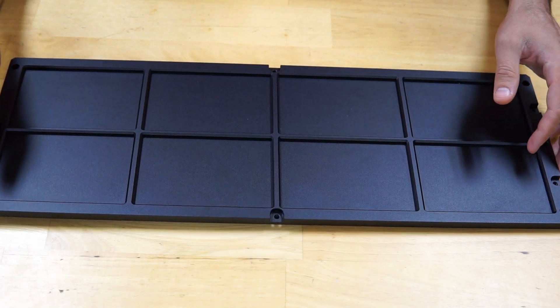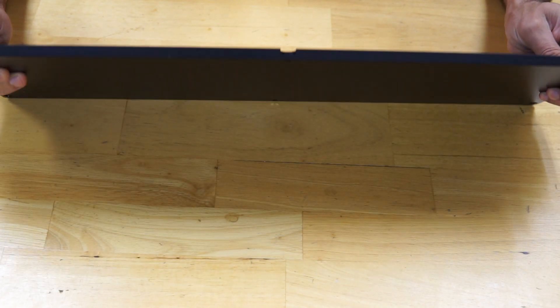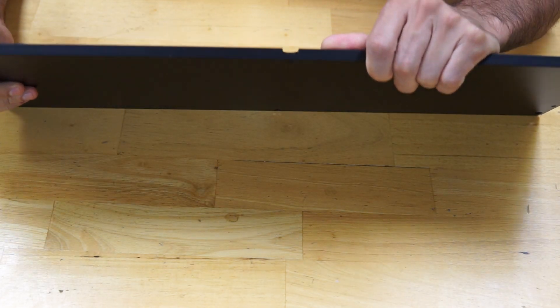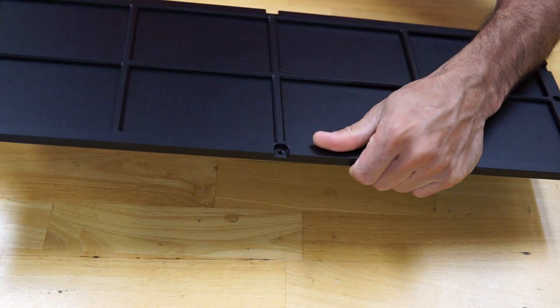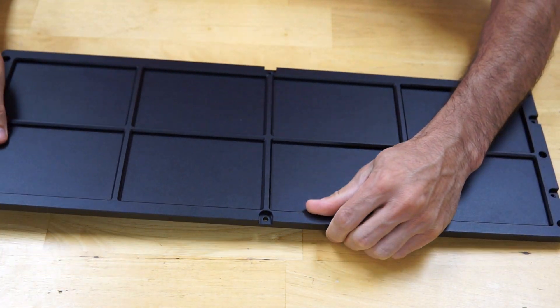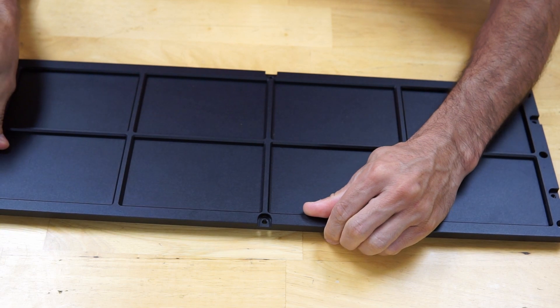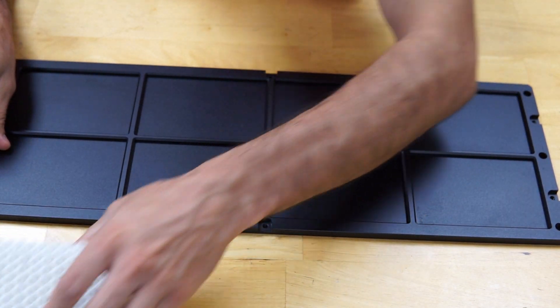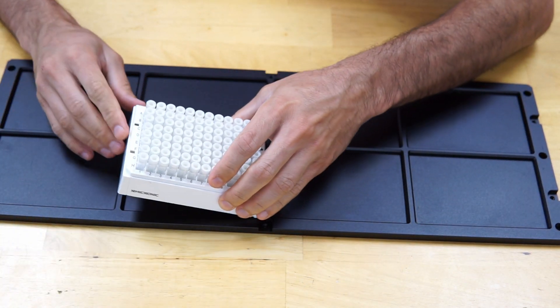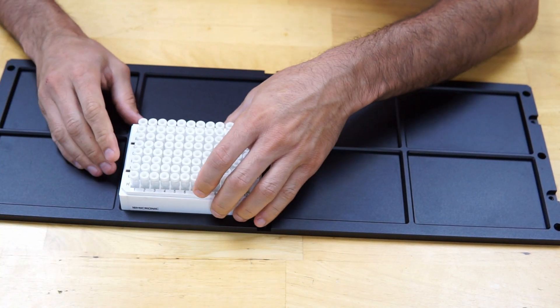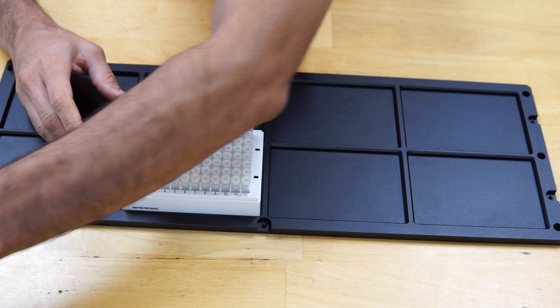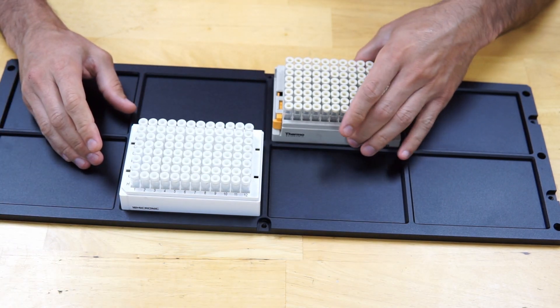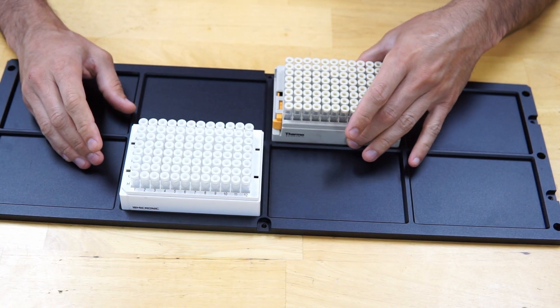We made the fixture plates out of 10 mm aluminum and finished them with anodized coating. The slots for the microplates are designed so they can be put in and removed from fixtures with no effort and at the same time they have almost no play when they are in the slots.